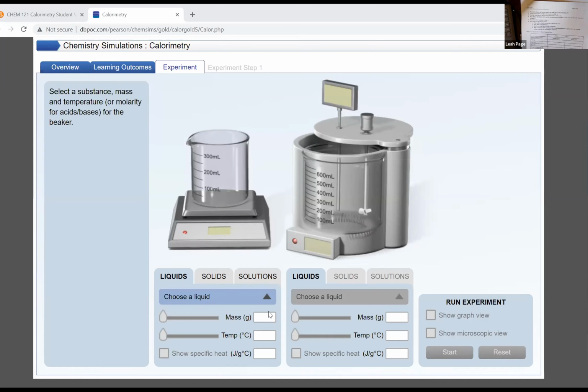That's why we can say it's either positive or negative, because if it's positive, that means it's going into a substance. If it's negative, that means it's going out of a substance. So it's still just saying we're going from one substance to another, and that's just in our entire universe. We are transferring energy all the time. So one way to measure how much energy is being transferred is we're going to use calorimetry. And this metal piece right here, this big metal device right here, is called a calorimeter. And it just measures the amount of heat transferred.